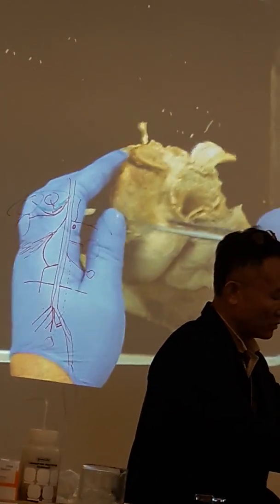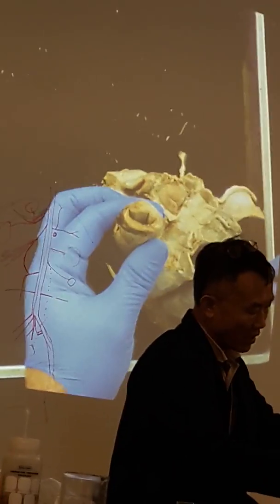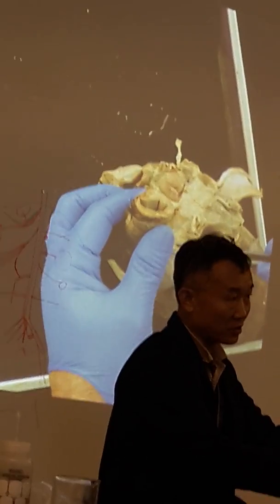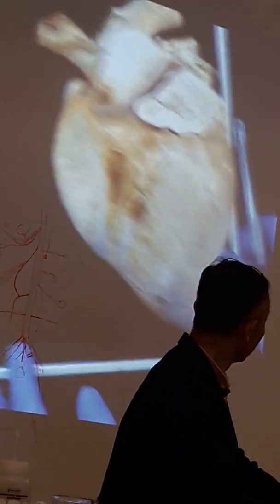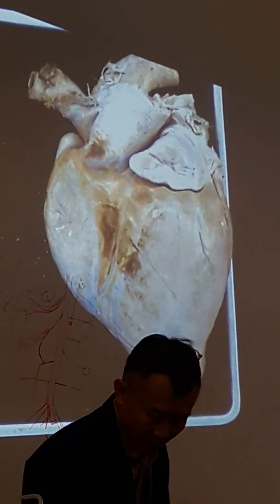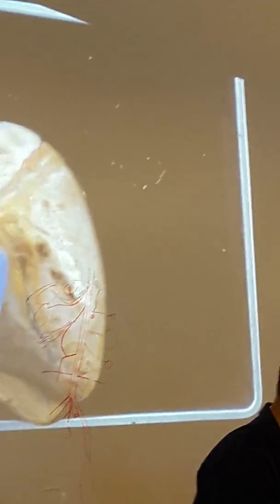You still see something over here. Okay. So that's remnants. Fetus. This is a duct. Okay, it's a bypass. All right. Superior vena cava and inferior vena cava. Then you have to go to the back view. Go to the back.